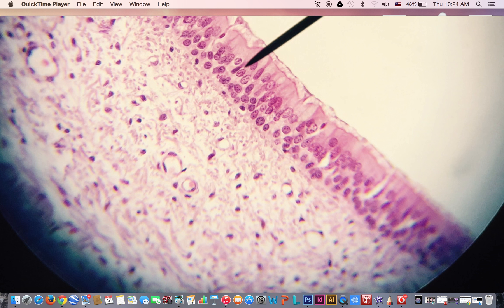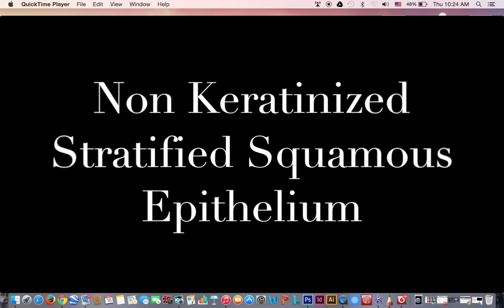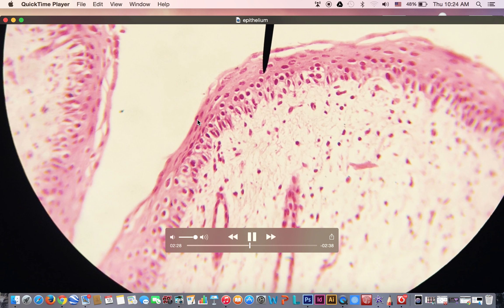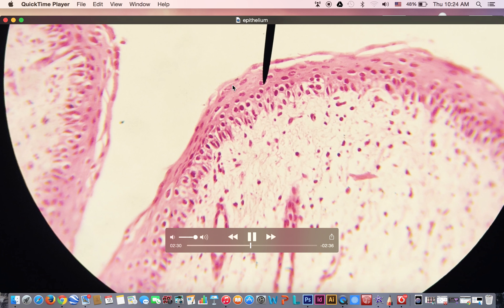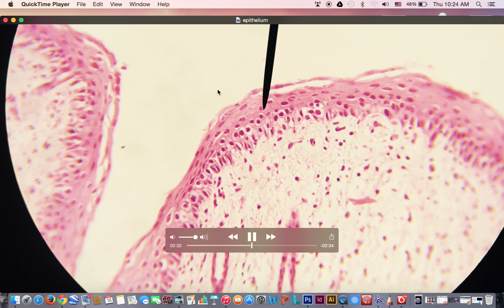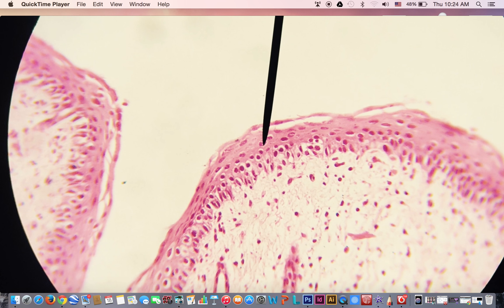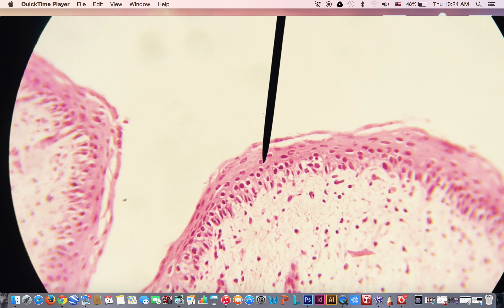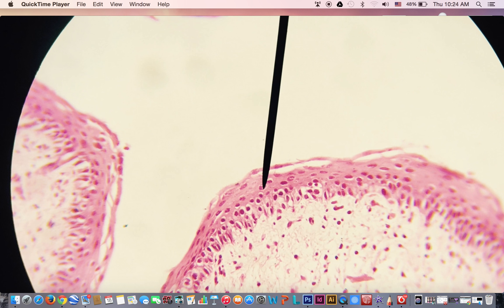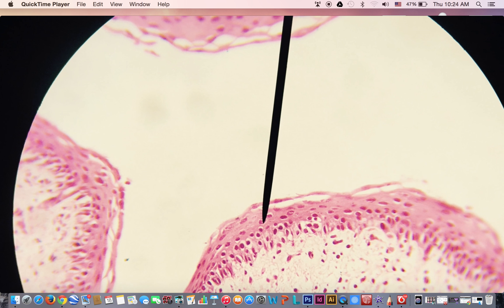Then we have the non-keratinized stratified squamous epithelium. It has different layers, and the top layer is formed of flat squamous cells with flat nuclei, with no keratin on the surface. This epithelium is present in the oral cavity and the vagina, as these areas are always wet and not exposed to wear and tear.